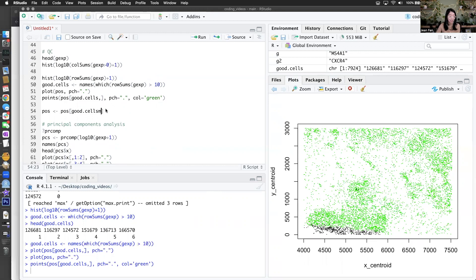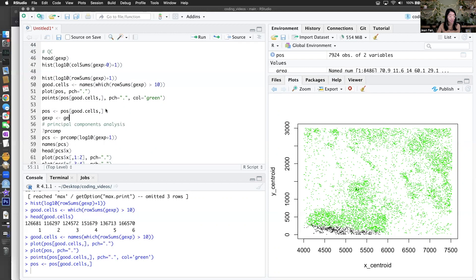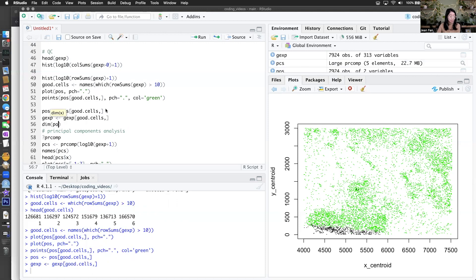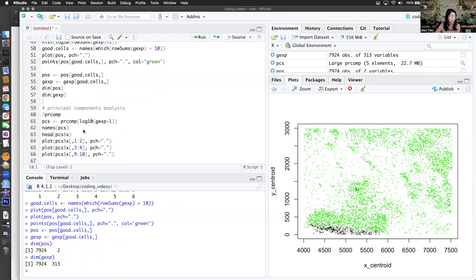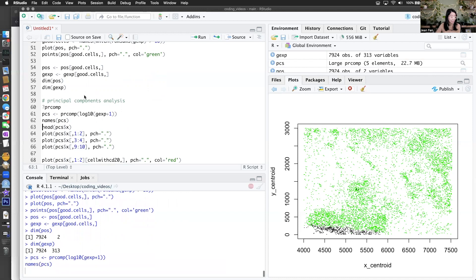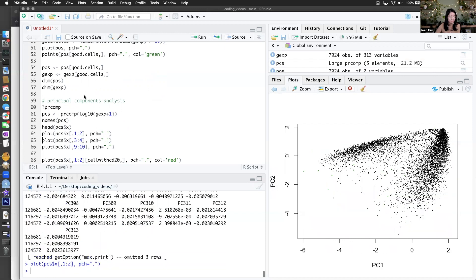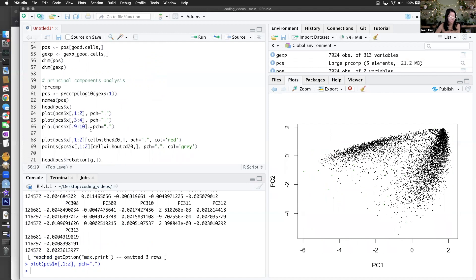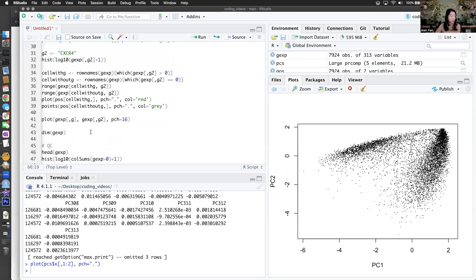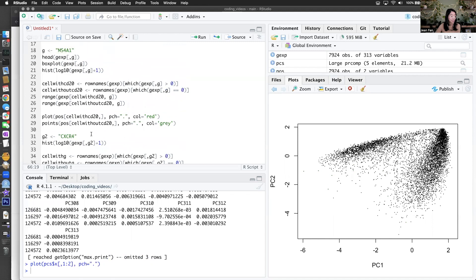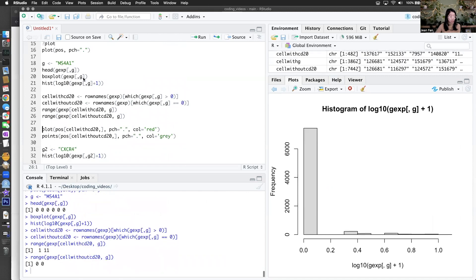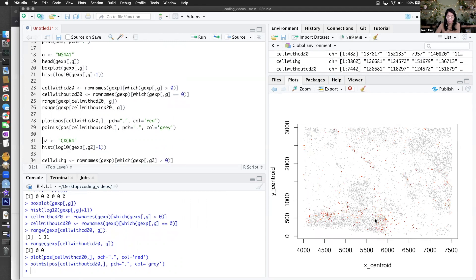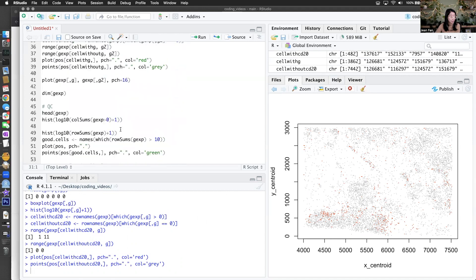Okay, so I'm going to just keep only my good cells, and same thing with my gene expression — I'm going to keep only the good cells. We've now lost some cells and we're down below 8,000. So now hopefully we can again do our principal components analysis. The PCs changed a little, but the trends with CD20 still look the same and the spatial patterns mostly still look the same. This little subset of cells doesn't really impact much of what we saw before.